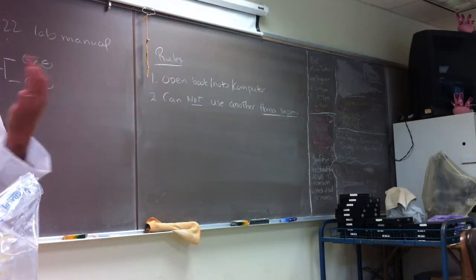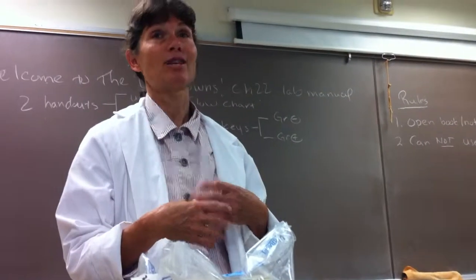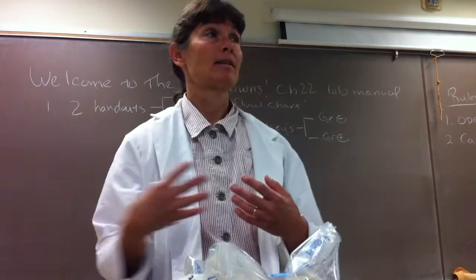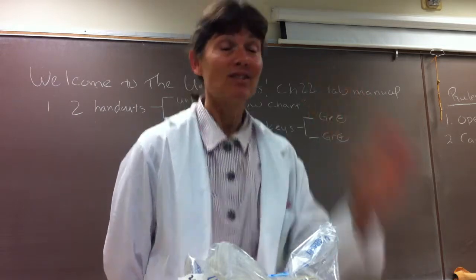All right, so technical help means you can't have someone help you figure out how to do a gram stain. You can't have somebody look at your bacteria and tell you, are they gram negative, are they gram positive, what's the cell shape, what's the cell size. You can't ask somebody, how do I run this test? Which media do I use? You can't ask somebody, will you look at my MR tube and tell me if this is positive or negative? Okay, so you can talk.